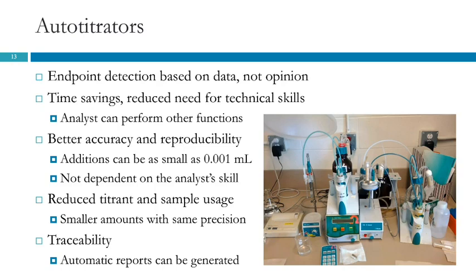So in an analytical chemistry lab, are you routinely doing titrations with glass burettes? No, you're not. Does a glass burette work? Doing it manually by hand? Absolutely it does. But there's some issues when it comes to an analytical chemistry lab. So an auto titrator, and this is just a picture of one that I pulled off the internet.